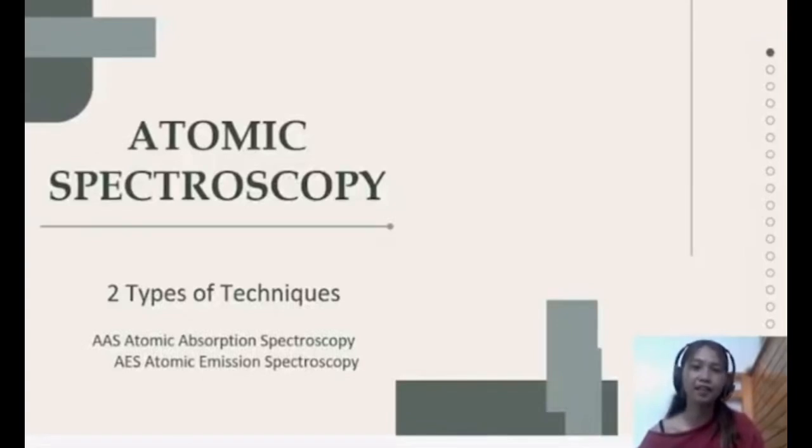So good morning, and let's tackle atomic spectroscopy. Atomic spectroscopy is like a fingerprinting technique for atoms. Just like every person has a unique fingerprint, every type of atom has a unique pattern of light.